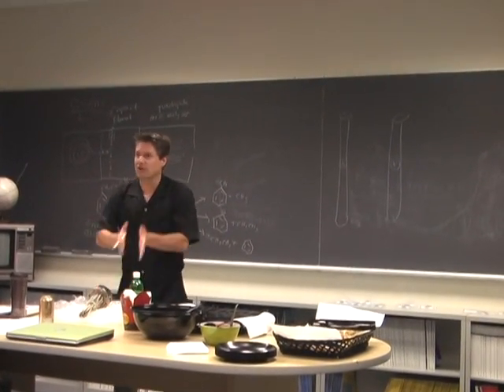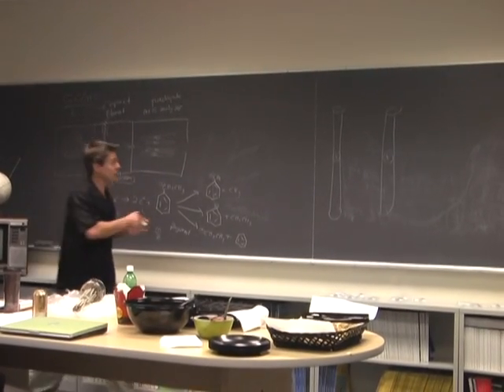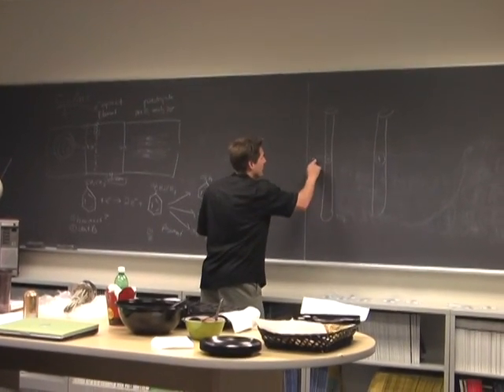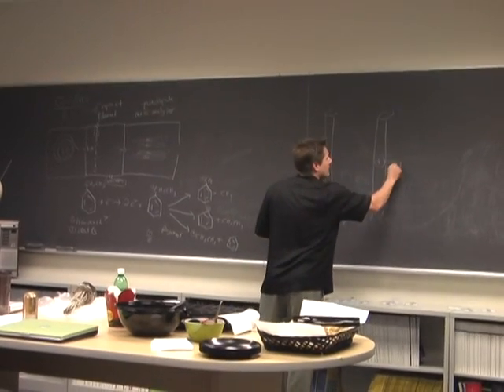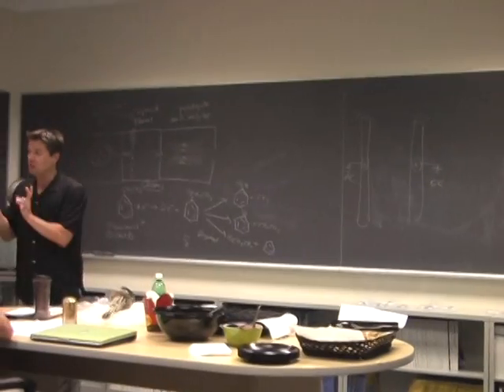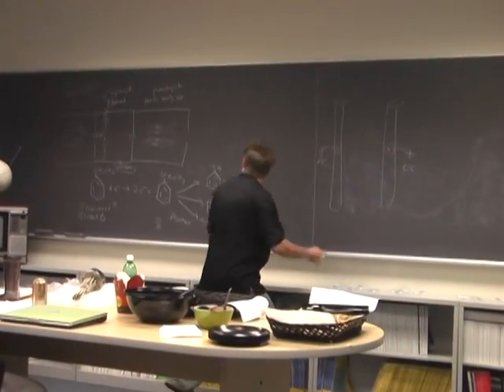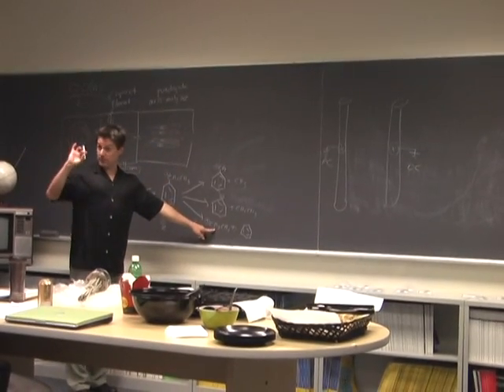I'm going to show you why we do it, because we're going to scan through different voltages so we can scan through all the different masses, mass to charge ratios. So I'm going to connect the DC current to these, and that's positive, so those always have that DC current. If that's all they had, let's see if this is effective as a mass analyzer. Let's say I have a small ion fragment, small mass.